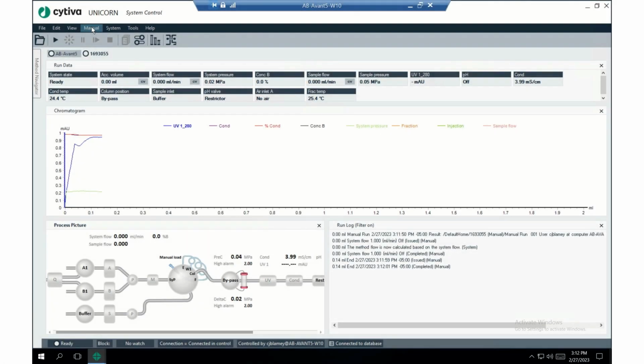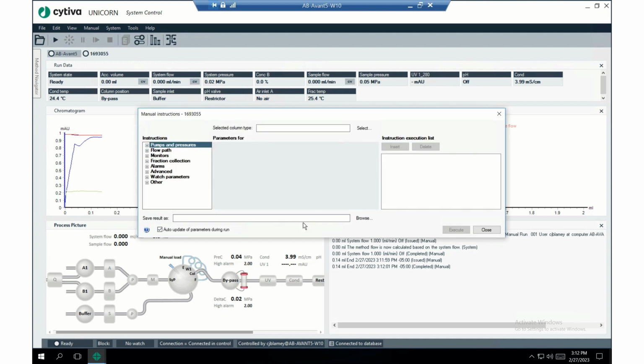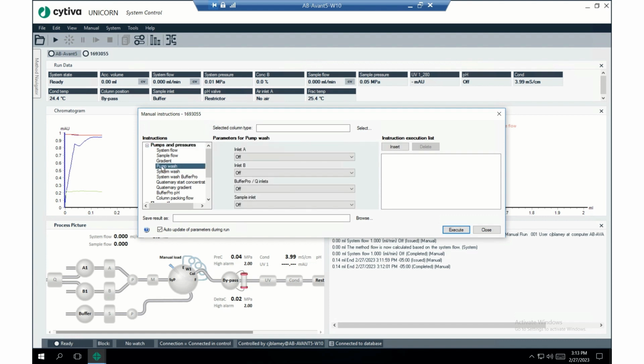The next thing we're going to do is go up to the manual tab, and we're going to select the execute manual instruction, and the window will come up. So normally what we would do is a pump wash to start out with, and we would also want to make sure the pumps are primed, but there's another video I have on this. This is the instruction right here you would issue. So we're going to skip this step.